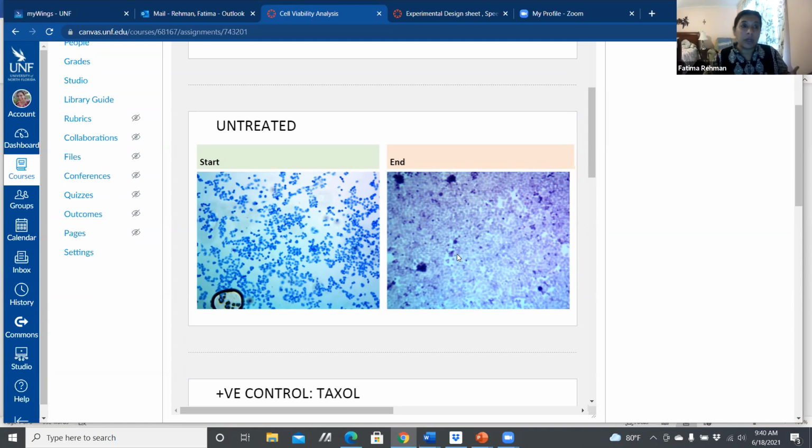In culture, normally we look at confluence when they're still unstained, so it's sometimes harder. This time, I've kept them stained, so it should be easy for you to determine what percentage of the image is covered in blue and what is clear. The blue in this case is the cells. This is going to be used to determine the confluence of your culture. You decide amongst yourselves, everyone gives their answer, and then you write your answer, whether it's 50%, 60%, whatever.